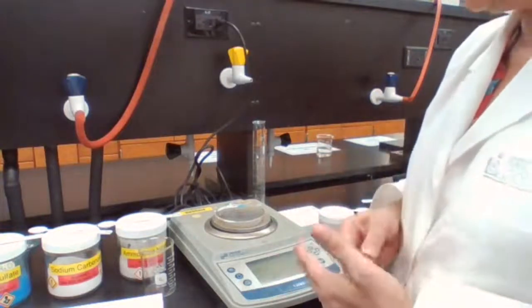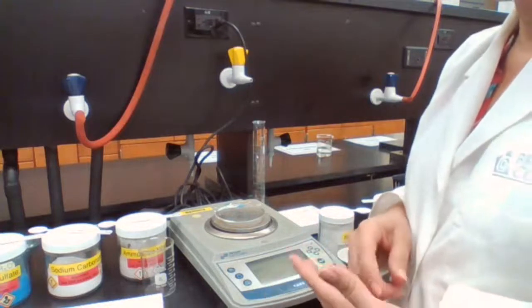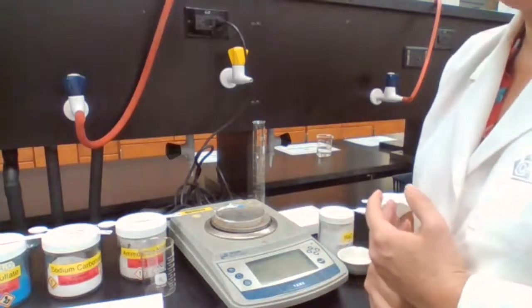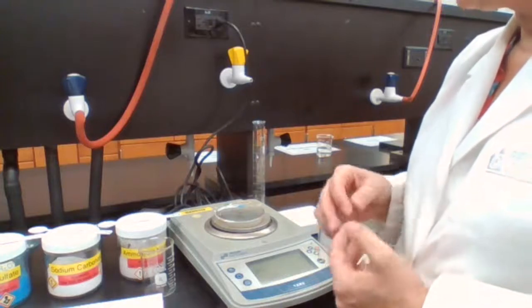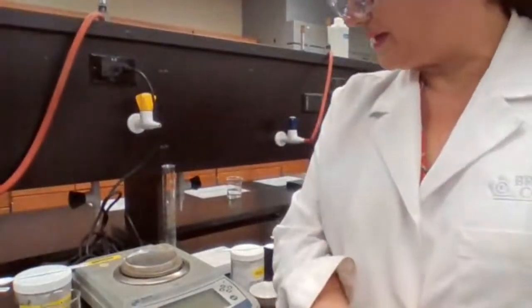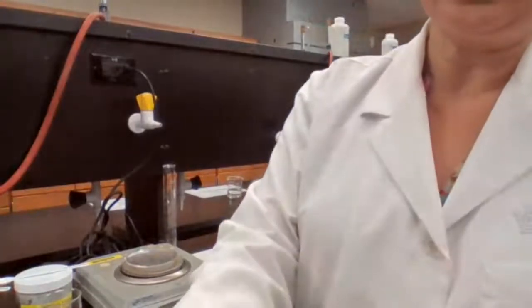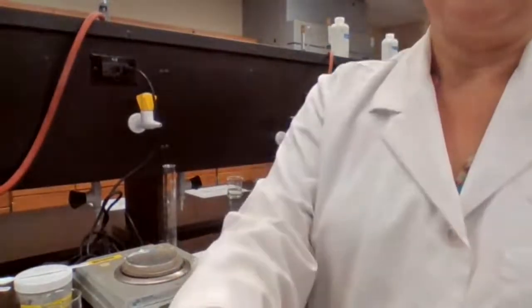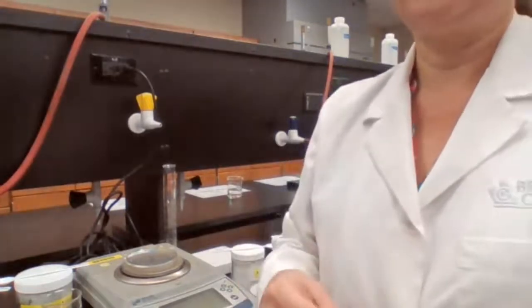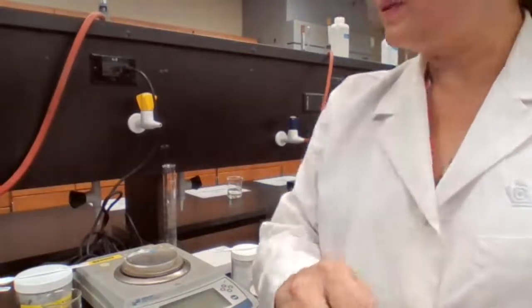For experiment 2 and on, whenever you are going to measure a mass, first of all you have to decide right away whether you should measure mass directly, use mass by difference, or use an indirect measurement. This is also practice for recording numbers properly with the proper number of significant figures, which shows the accuracy of your measuring device. This balance gives me 3 decimal places, and those 3 decimal places need to be recorded. So 48.110 is the mass of the watch glass.